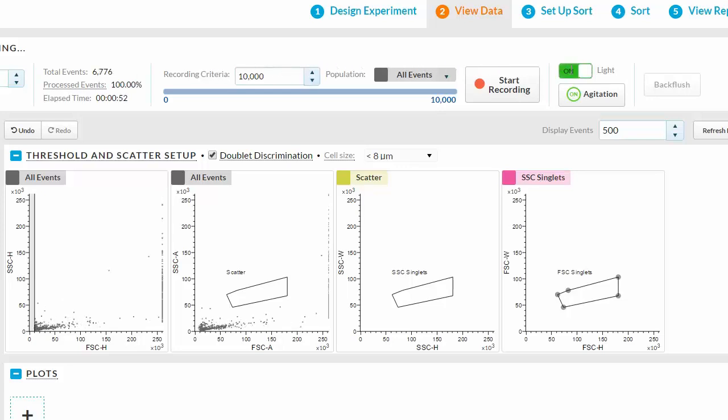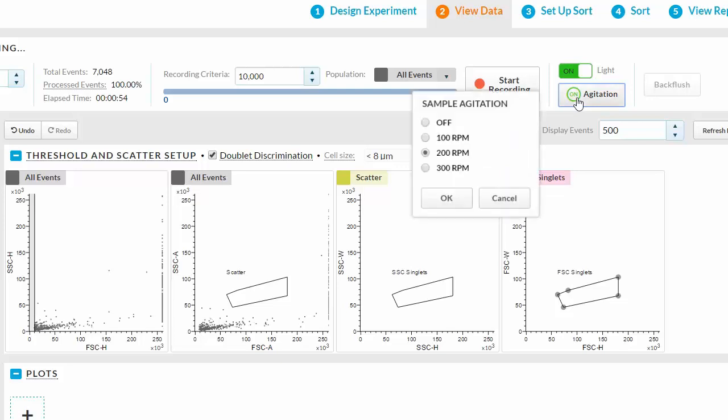There is an option to turn the light on or off in the sample viewing window. The Agitation option allows you to keep the sample constantly suspended. Select the rate of agitation.